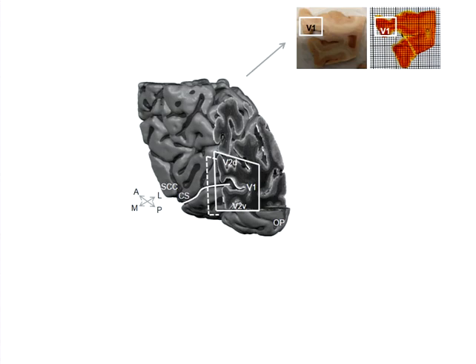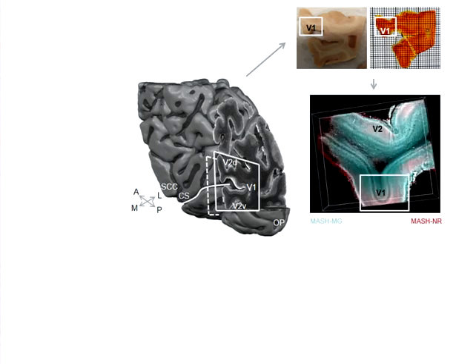Here you see some results from the more posterior thick-lined piece. Here it was before clearing, when it was just excised. Here it is after clearing. Indeed, you can see the rather large dimensions and the nice transparency after clearing. Here you see the double MG and NR label, V2 over here and V1 over here.